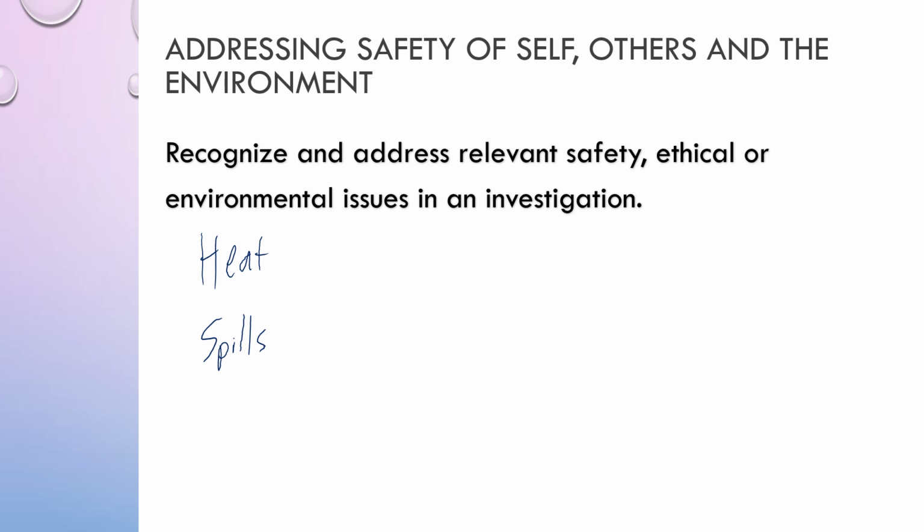It really depends on what substances you're using and your local guidelines. Another good one would be if a reaction is producing a gas or vapor. Some cases you might need to be using a fume hood to protect yourself and others from the exposure to that gas. But again, it depends on which gas is being formed.